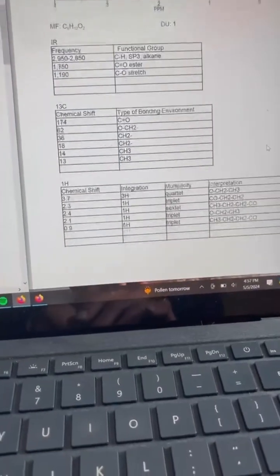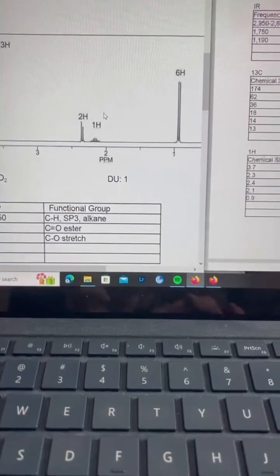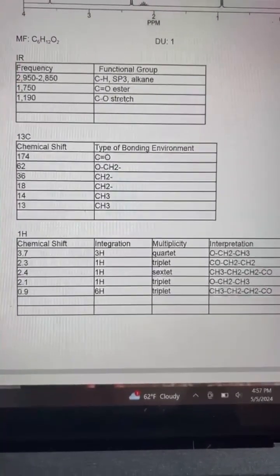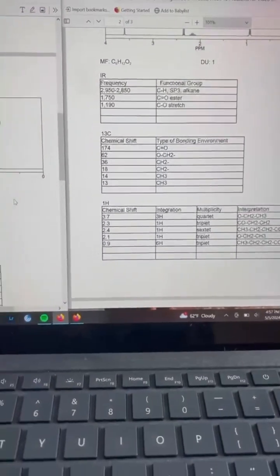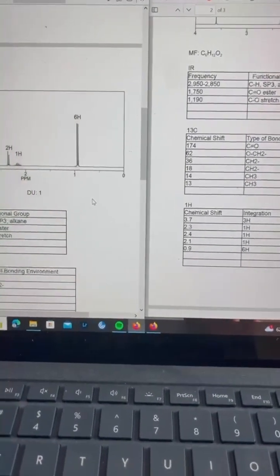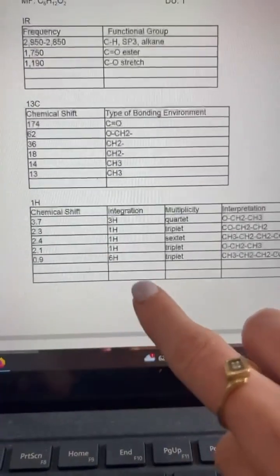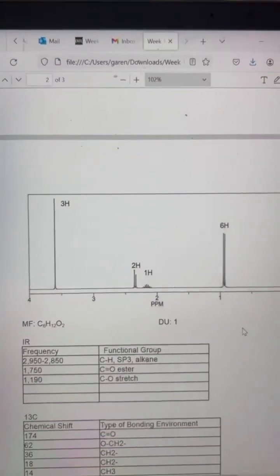And then moving down into the hydrogen table. And so the 1H table will show where your hydrogens are observed, including whether they are shielded or unshielded in their multiplicity. Multiplicity simply means the appearance of groups, symmetric peaks representing one hydrogen in the NMR spectroscopy. So we have all of our hydrogens, all 12 represented here, and then they correlate on the following table.